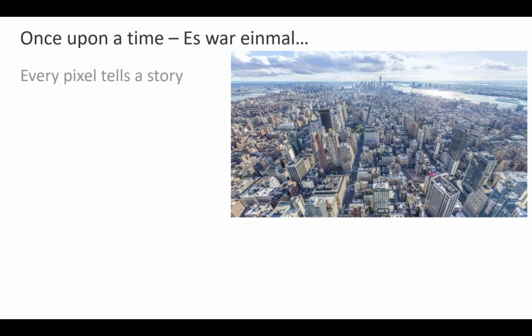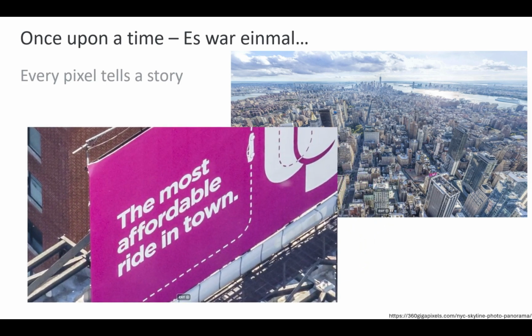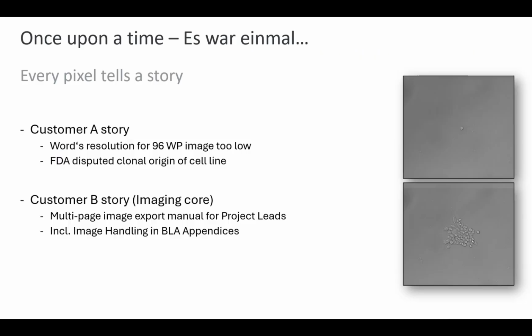Having said that, the proof of monoclonality in principle is very easily done, but the problem, especially in 96 well plates, is this one. You have a lot of data and a lot of pixel ground to cover for an object that is really, really small compared to the full image size, because it needs to be full well in the 96 or 384 or whatever well plate format.